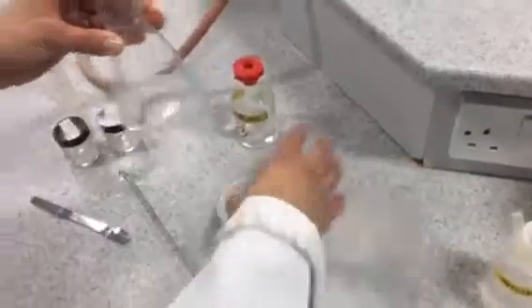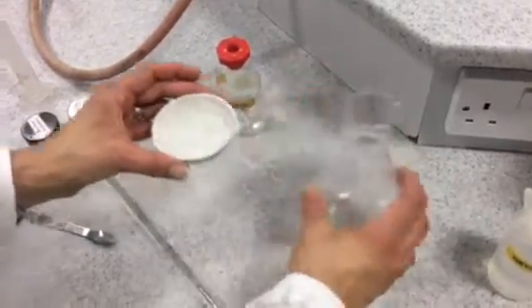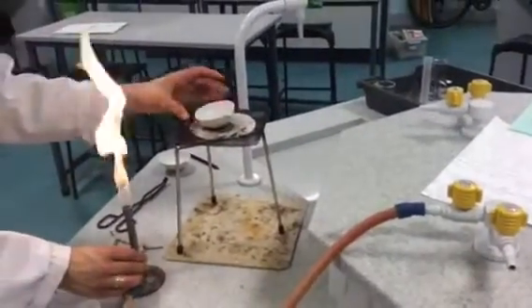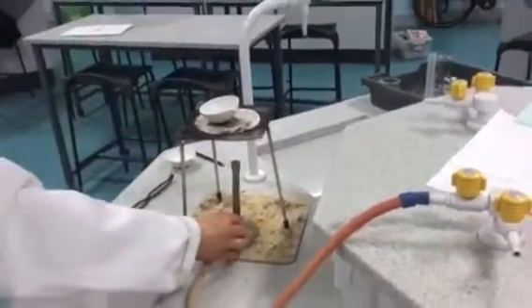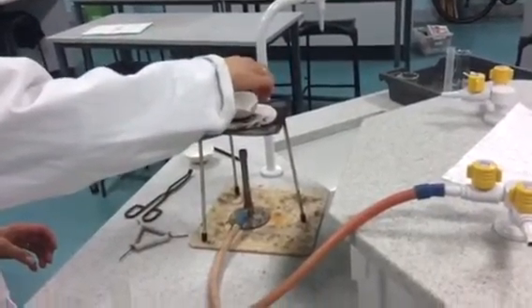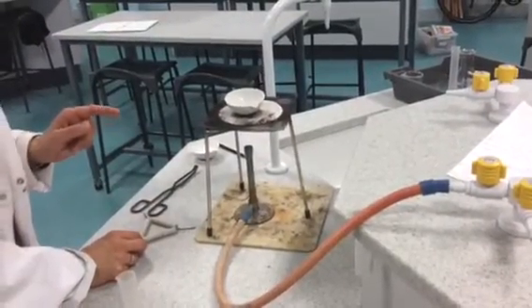Pour that into an evaporating basin and put it over the Bunsen burner and heat that up gently. This might take about 10 minutes. Heat that up gently until most of the water has evaporated.